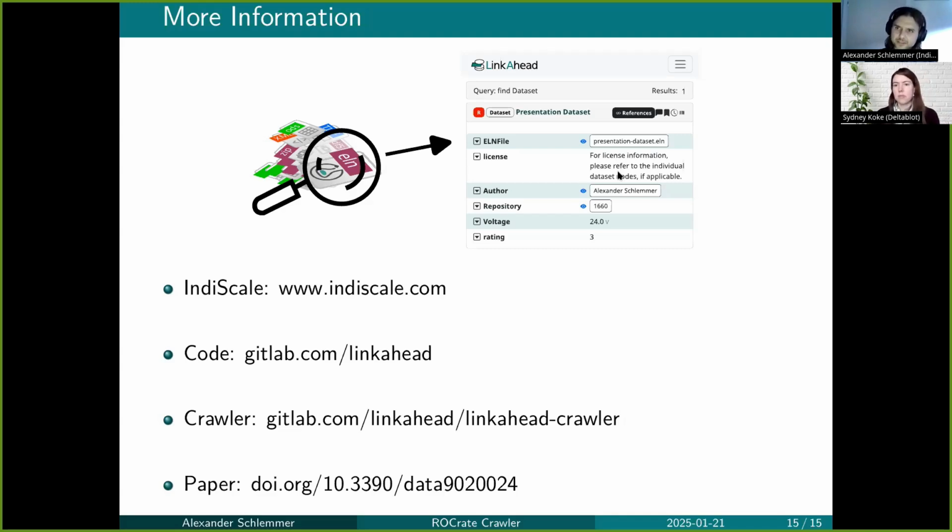Is that right? Yes, of course, that's possible to do. As you can include distinctions between different files, and the most straightforward way would be to match specific contents of the file, like for example the source address that is contained, I think, in most of the ELN files I've seen so far.